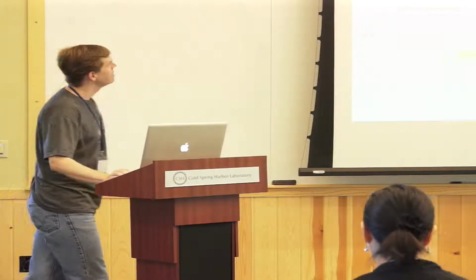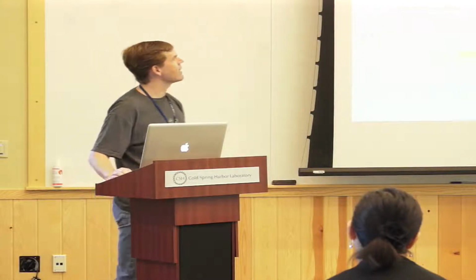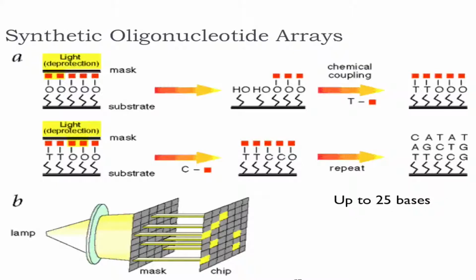Synthetic oligonucleotide arrays are different than that. We're not typically starting with the whole transcript because it's hard to make oligos multiple kilobases long. So we're typically starting with shorter nucleotides. And these are made, in many cases these days, in silico. Or they're made, not in silico, in situ. They're made actually on the array directly, and then the array ships out to the customer.